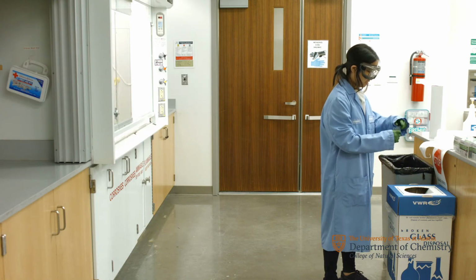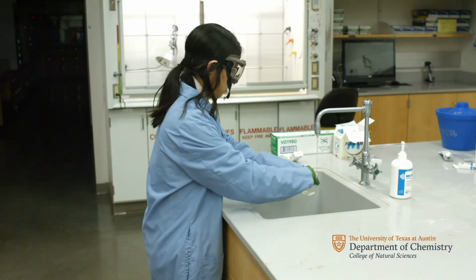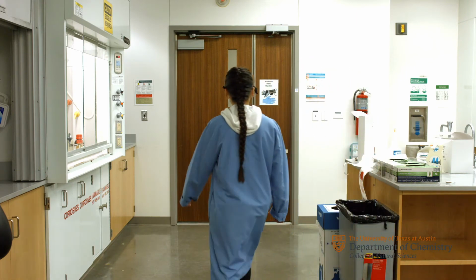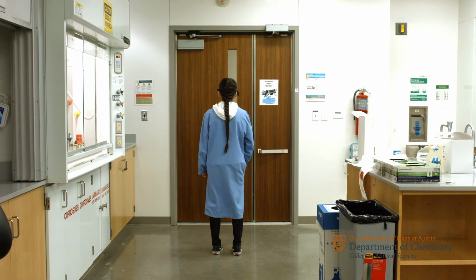Now dispose of all the test tubes into the glass waste container. Wash all your glassware and then put everything away. Finally, return the lab coat to the rack and the goggles to the UV cabinet.